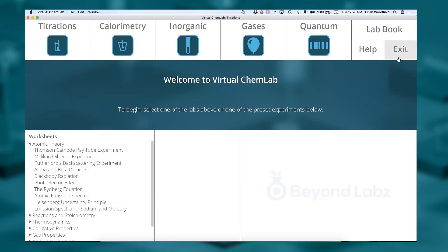So this is kind of how they all work. This is a general chemistry lab, focusing on what we typically teach in different levels of general chemistry.